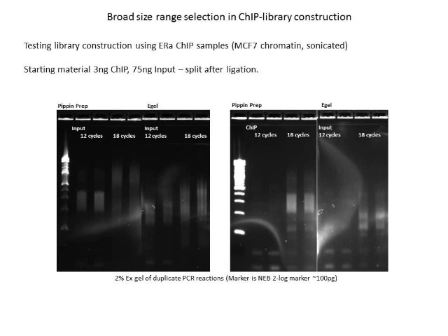The second marker here is 200, and it goes all the way up to between 400 and 500, which was what I selected for. And you can see that the size selection is working fairly well, and the yield looks pretty good. And it's comparable to what you would get from an eGel, which is also an efficient system. But with the eGel, you don't get this broad size range, and you might miss stuff.